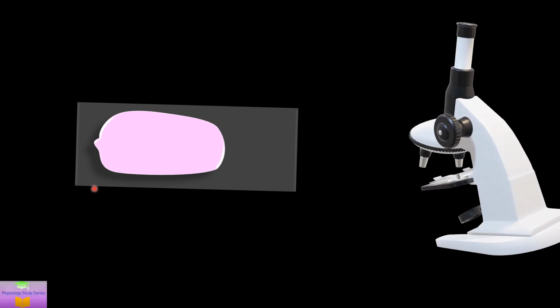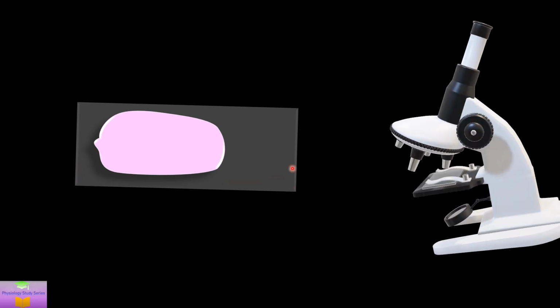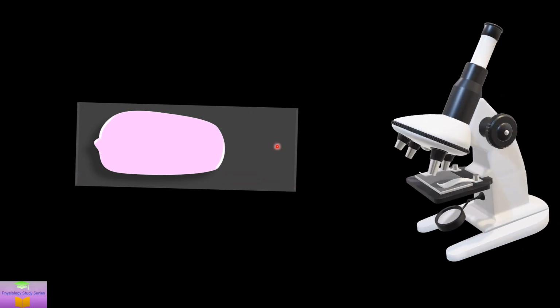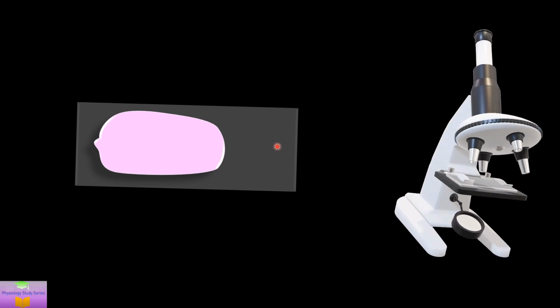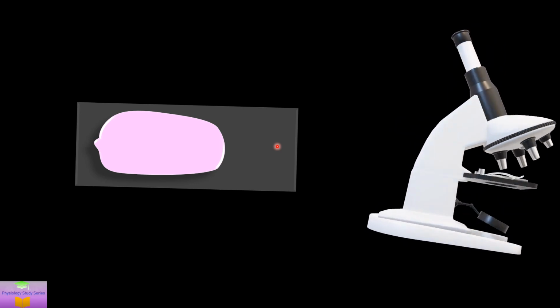After preparation of a peripheral blood smear, by observing all the necessary precautions during the procedure, we can get an ideal blood smear where we can identify all the leukocytes under oil immersion lens in the compound microscope, and we can do a differential leukocyte count based on the proportion of different types of WBC cells.